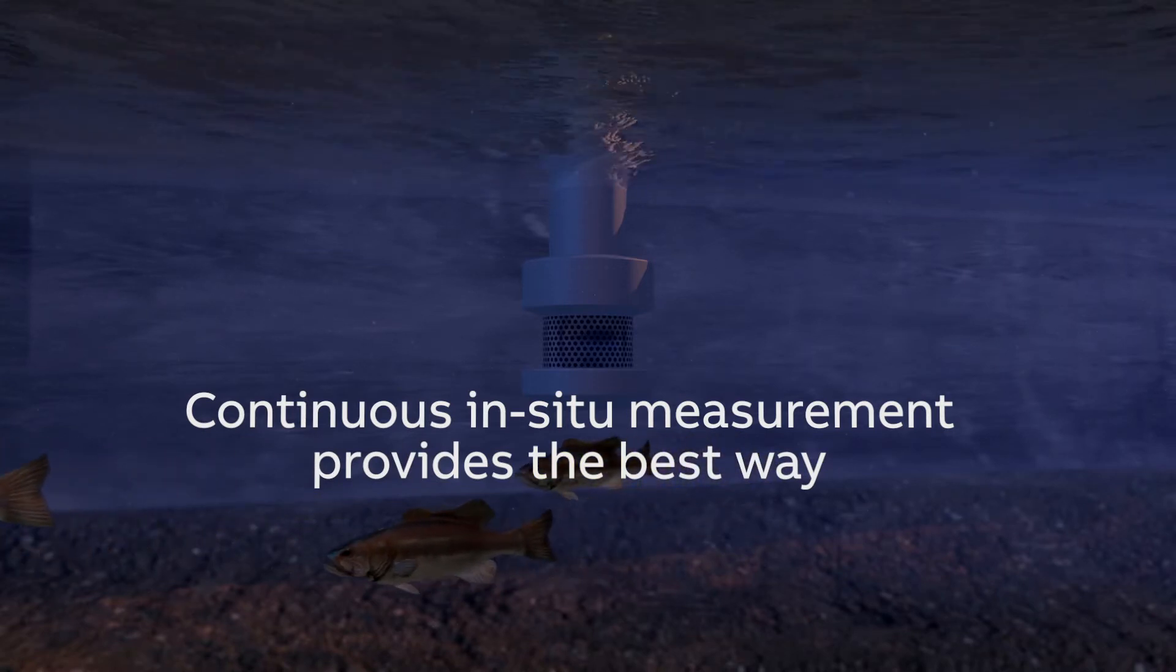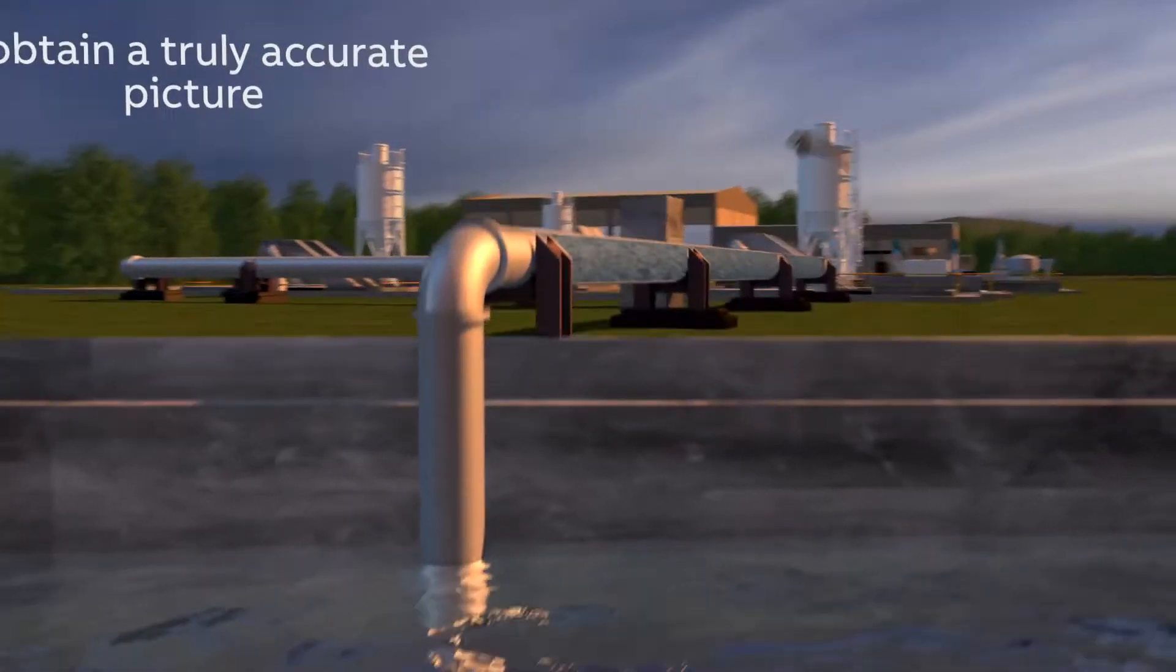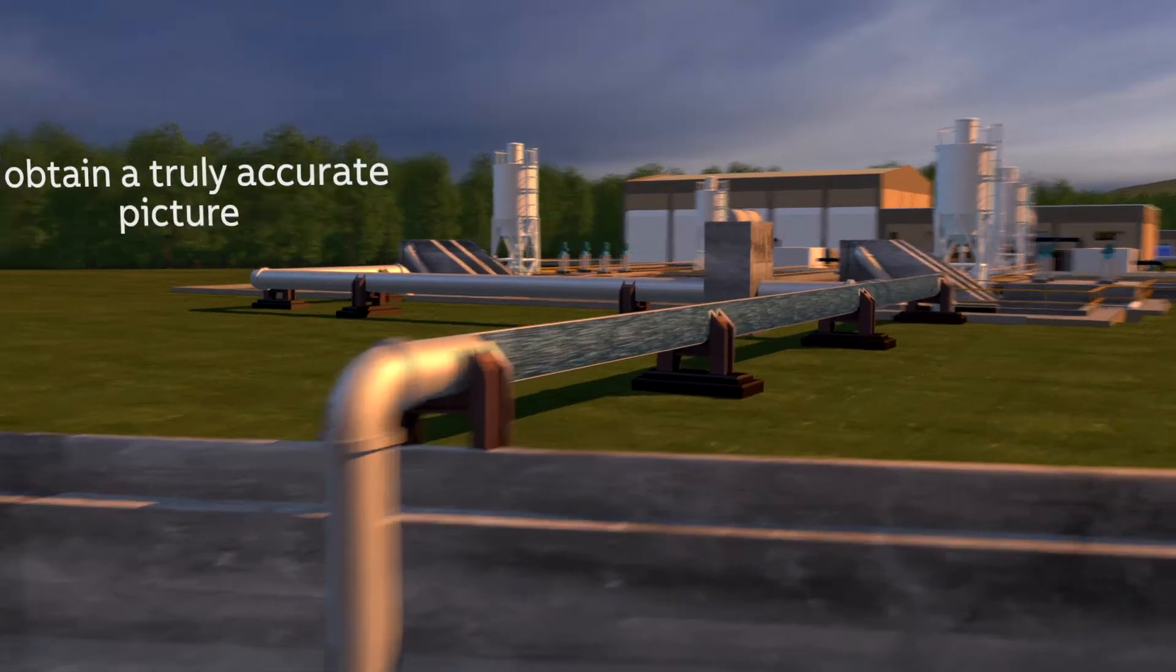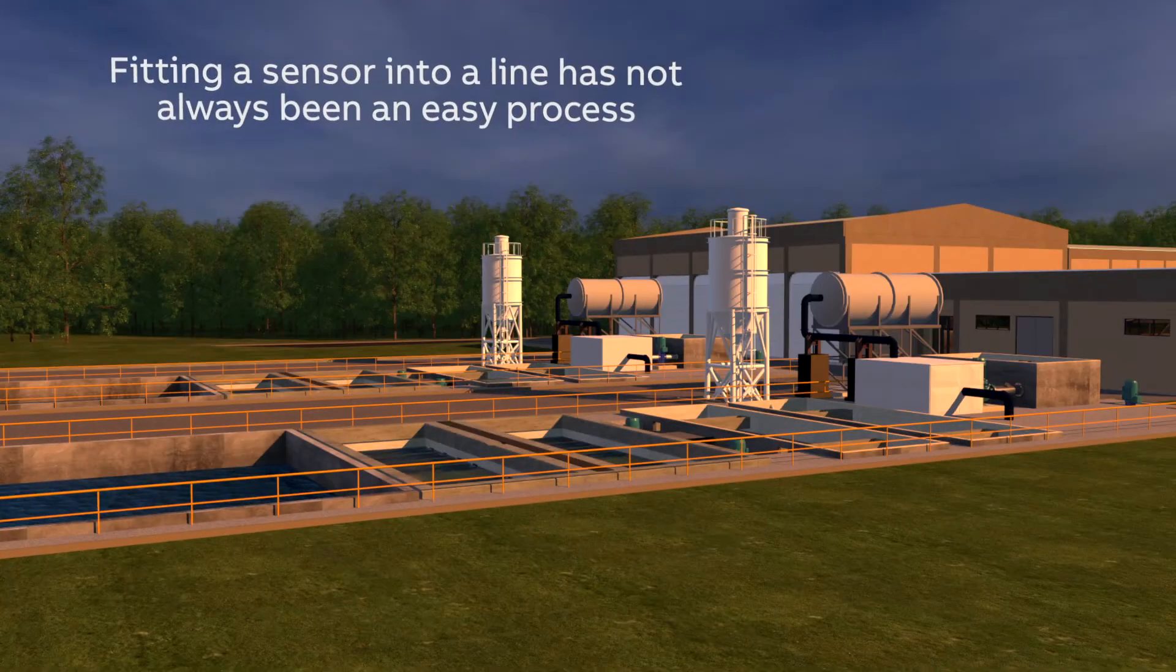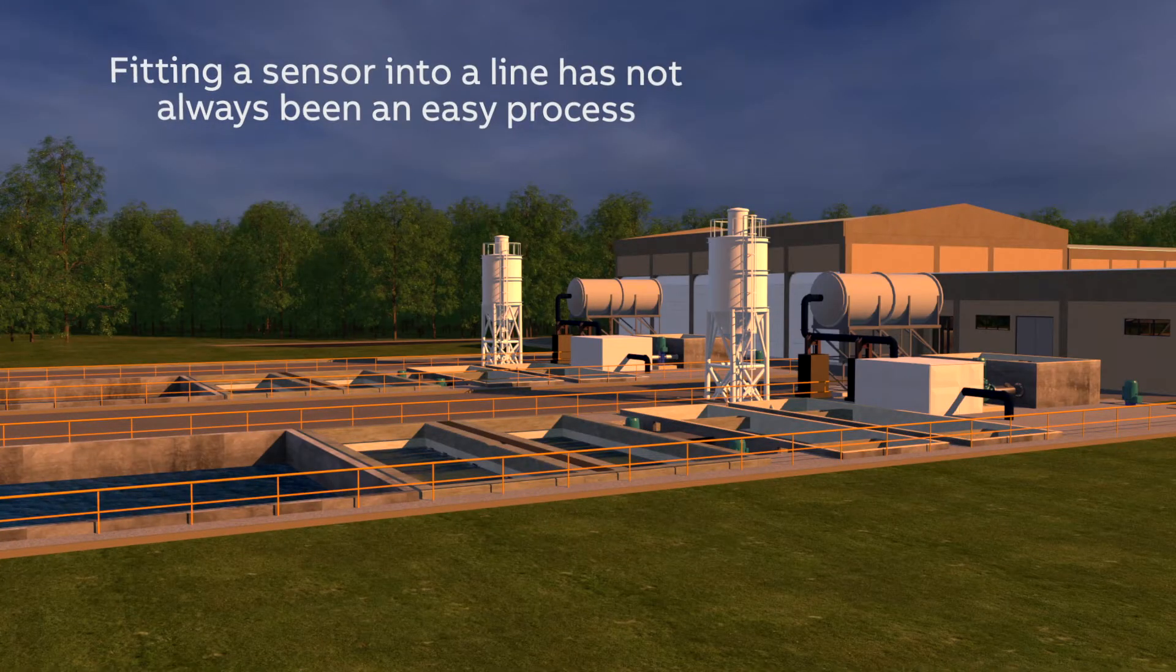Continuous in situ measurement provides the best way to obtain a truly accurate picture of what's happening within a pipeline. However, fitting a sensor into a line has not always been an easy process.